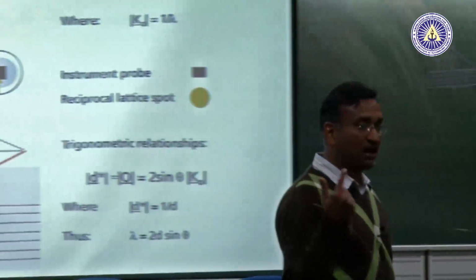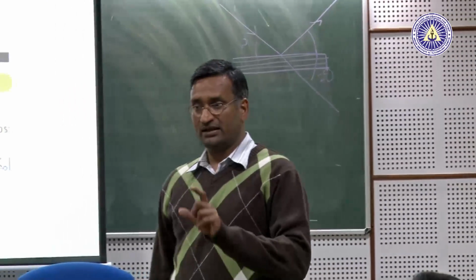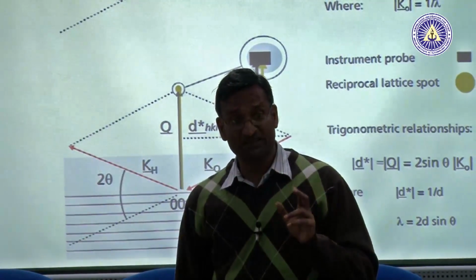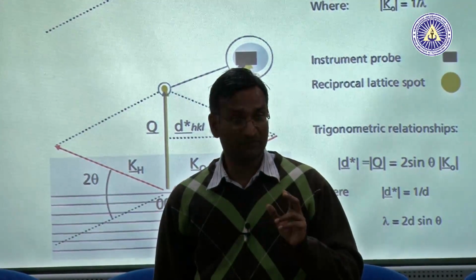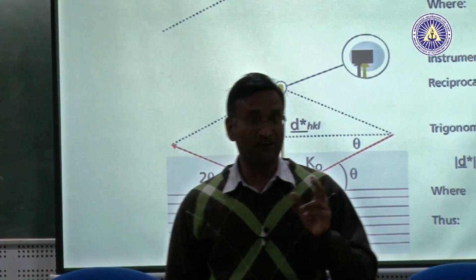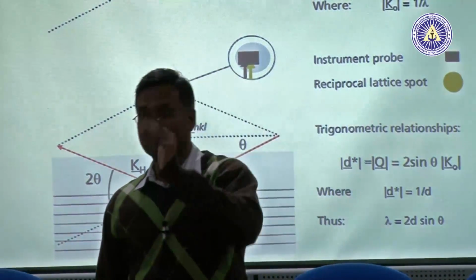If you have that, what are you going to have in terms of microscopically looking at the sample? A perfect single crystal will have perfect D spacing. Okay? A perfect D spacing will mean perfect theta. A perfect D spacing will also mean a perfect, well-defined G vector. If you do not have perfect D spacing, what will it mean? You will have different G's, which means you will have multiple diffraction spots.